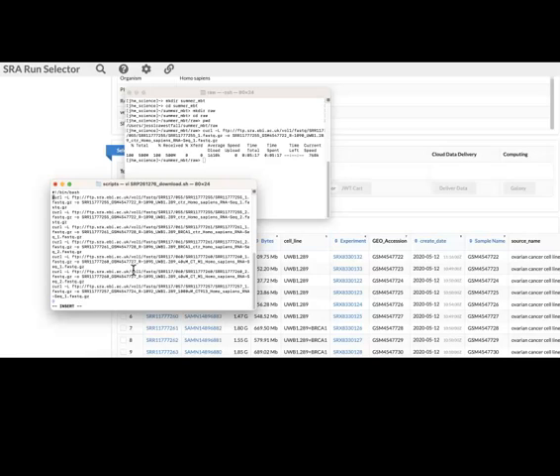So this is what I would put on the command line, but there are multiple command lines. So when I run the script, it's going to recognize it's a shell script, and it's going to start going through line by line to retrieve the command line itself. So now that I am done with copying, I'm going to press Escape, :wq. This allows me to exit and saves the file.